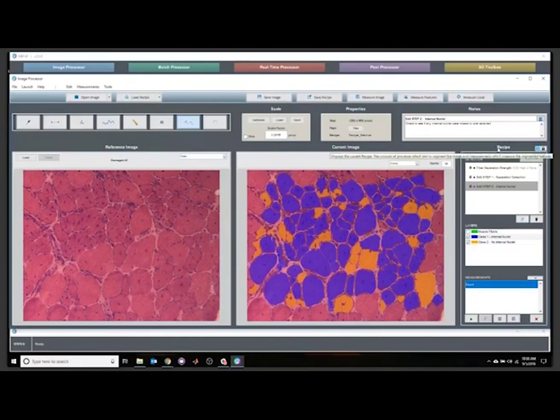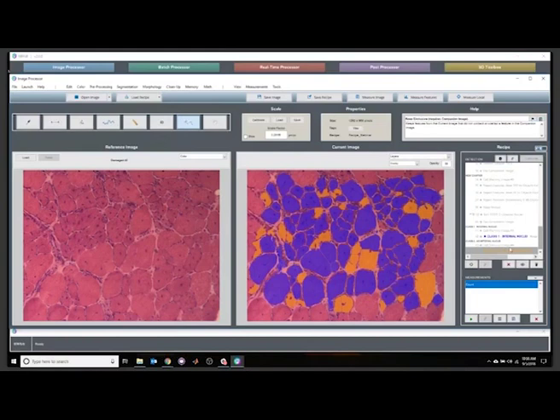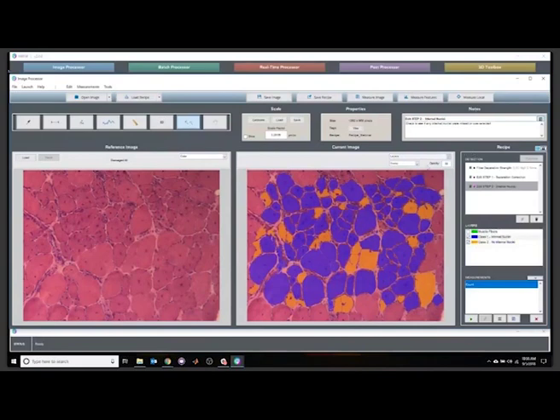The algorithm itself, which I can probably show for some of you who might be interested, is around 44 steps long. It's not very complicated, with pretty fundamental approaches such as color deconvolution, and then going in and separating this based on contrast.